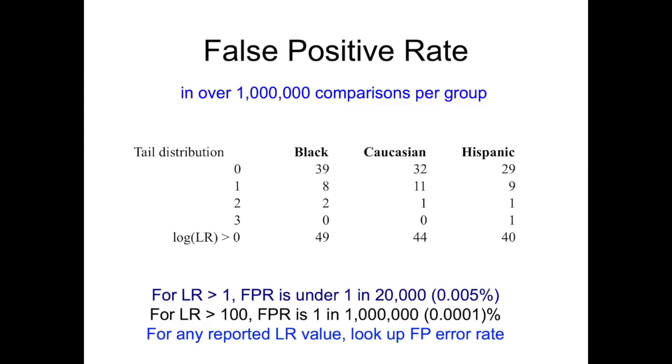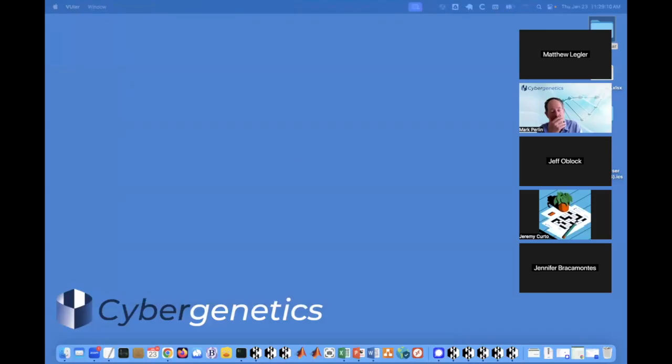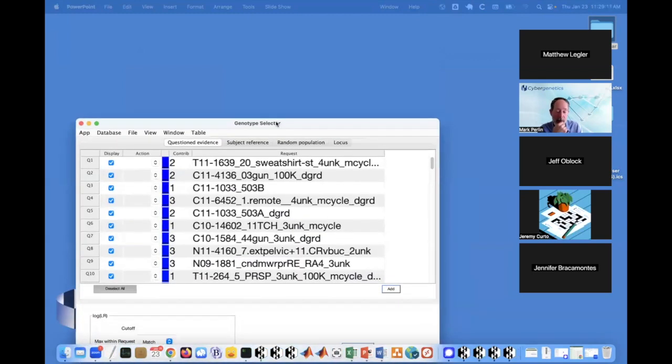Okay, so Matt, I think you'll be showing the demo. What we're showing is that instead of taking months, I asked Matt to generate this while I was talking and tell us how many seconds it took, or minutes. Did you time it? Yes.